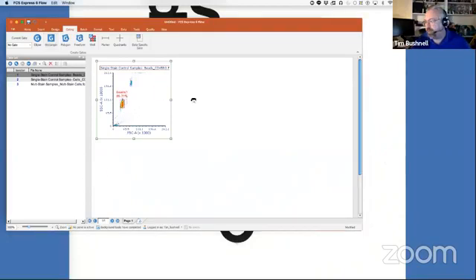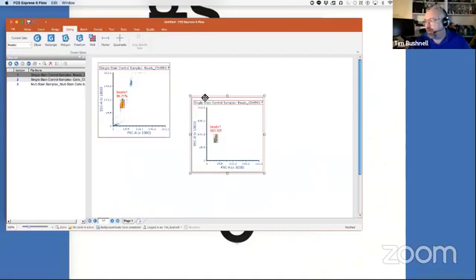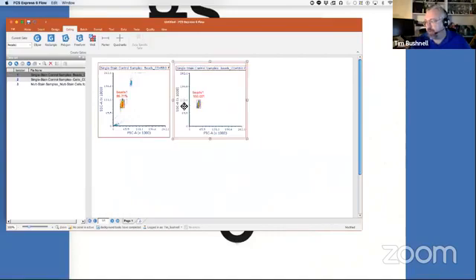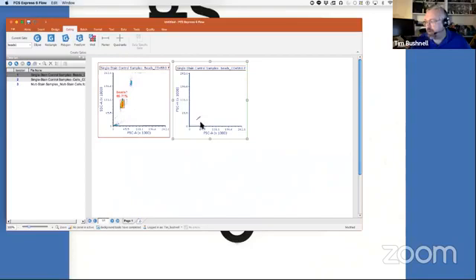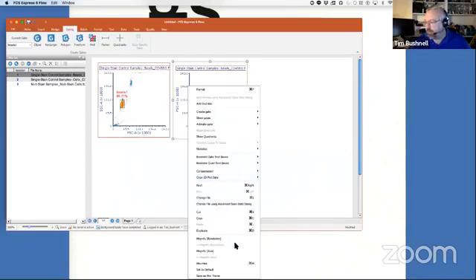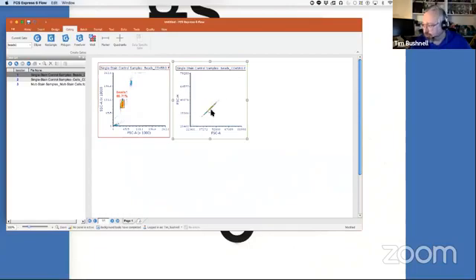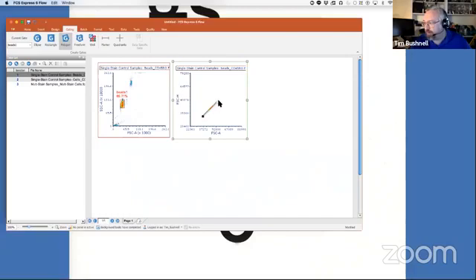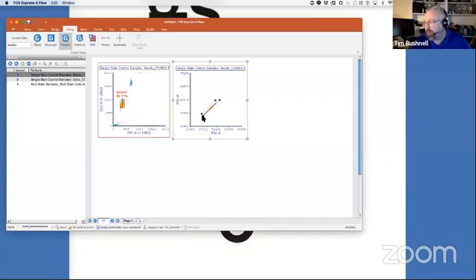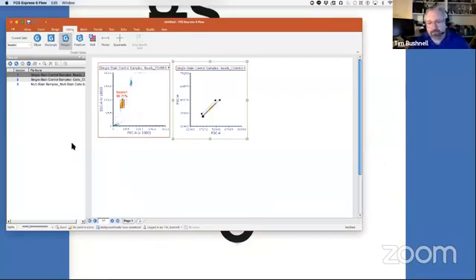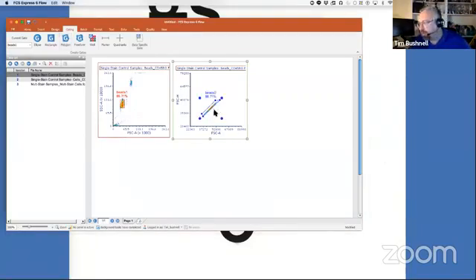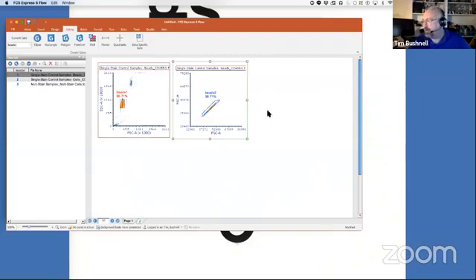I'm going to bring this over here. And this is going to be, I'm just going to make sure I have my single cells showing here. One thing I like to do with this is I like to magnify the resolution. So I can go right in and really look at just to make sure I'm going to get exactly what I want. You can see here the beads are very nice. We're only getting stuff that's on this diagonal. And you can see we're avoiding that debris there.